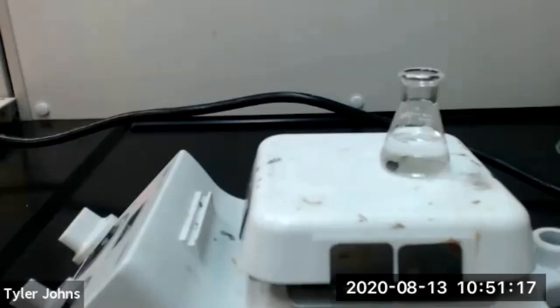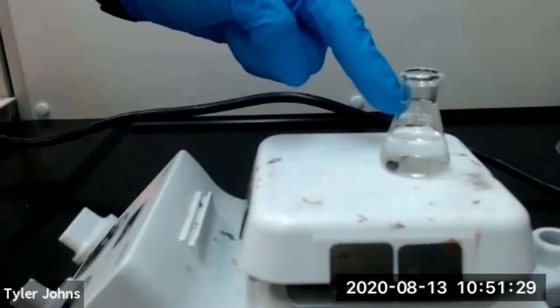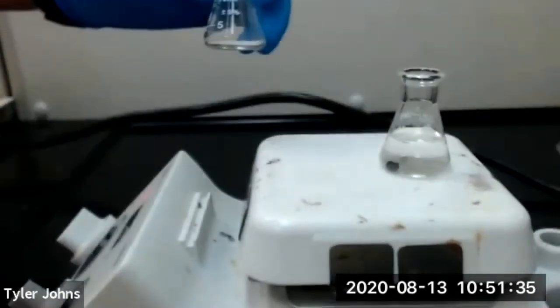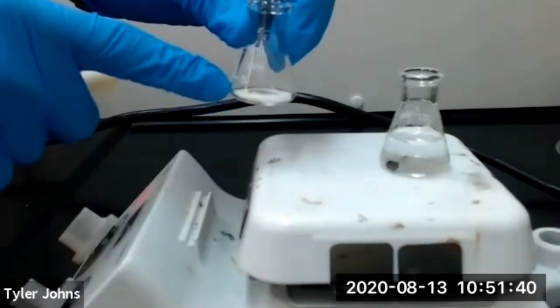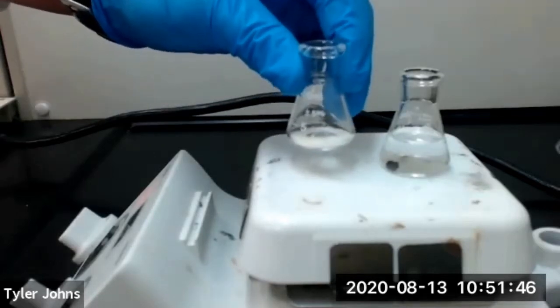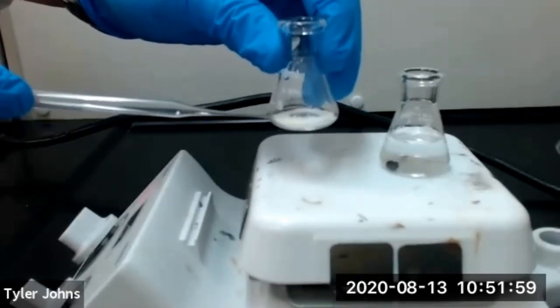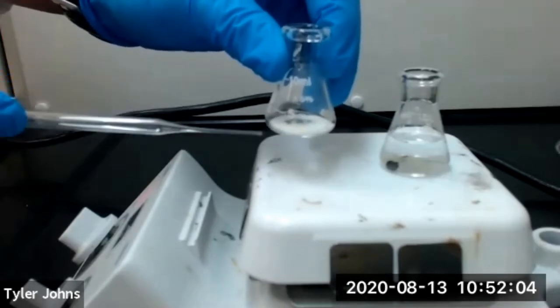As we wait for our 95% ethanol to come to a boil, I want to briefly describe the procedure. Once our 95% ethanol has come to a boil, we will transfer a very small amount using a Pasteur pipette to our Erlenmeyer flask with our impure sulfanilamide, set it on the hot plate, and allow the solvent to come to a boil. We don't want to put the impure sulfanilamide on the hot plate without solvent because it could potentially melt and form an oil.